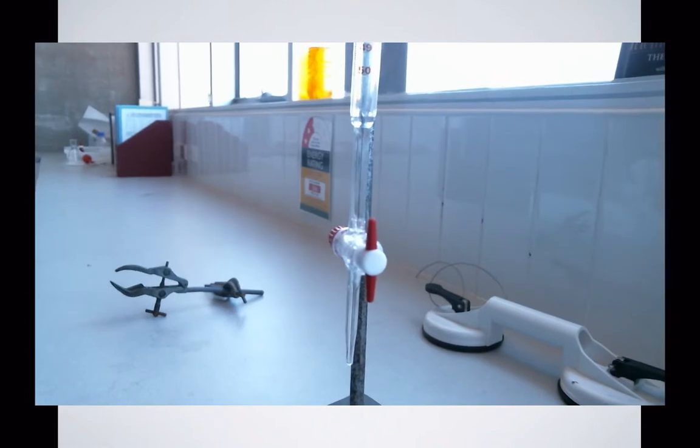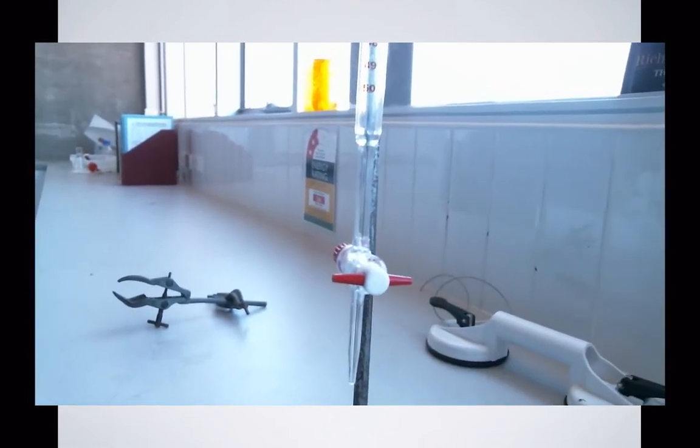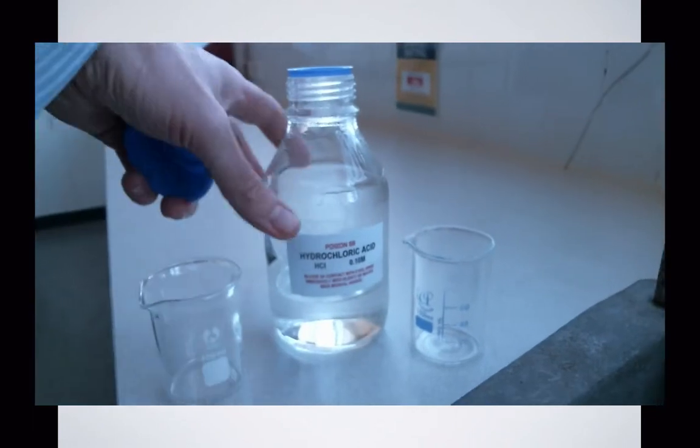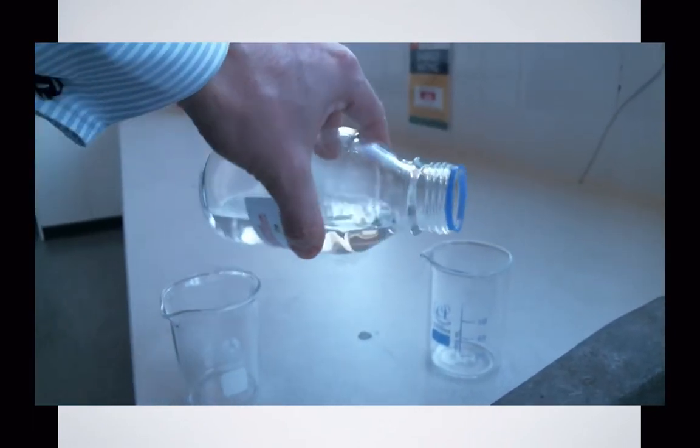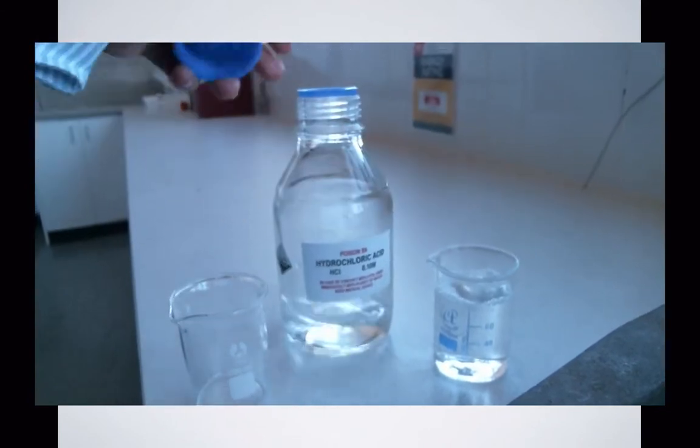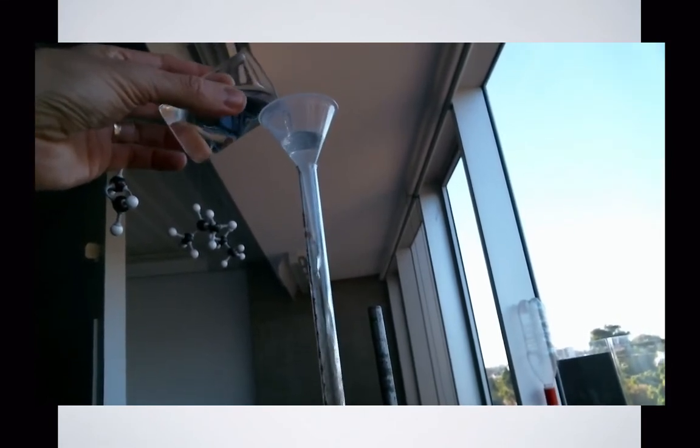Here we're looking at a burette tap which is closed when it's across the flow and open when it's in line with the flow. It doesn't matter which way you turn it, but it's a good idea to shut it before you start filling your burette. I'm putting some hydrochloric acid in a beaker because it's easier to pour from a beaker into the burette, but I'm still going to use a funnel to make sure I don't spill any liquid around the sides.